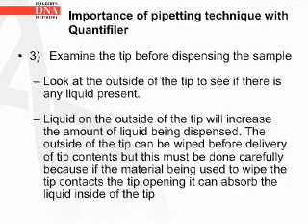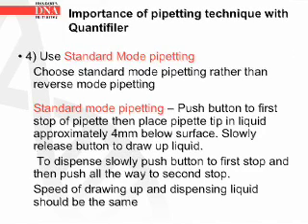Number 3. Examine the tip before dispensing the sample. Look at the outside of the tip to see if there's any liquid present. Liquid on the outside of the tip will increase the amount of liquid being dispensed. The outside of the tip can be wiped before delivery of tip contents, but this must be done carefully, because if the material being used to wipe the tip contacts the tip opening, it can absorb the liquid inside of the tip.